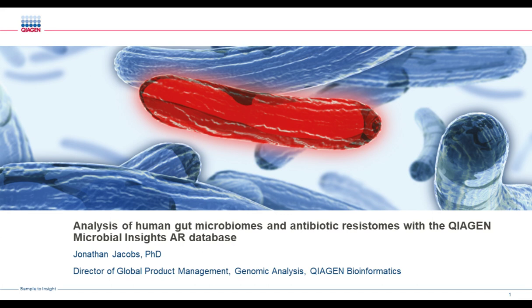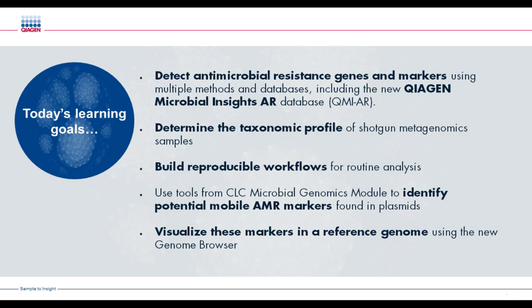And today we're going to be talking about the analysis of human gut microbiomes and antibiotic resistomes with QIAGEN's Microbial Insights AR Database and the CLC Genomics Workbench.